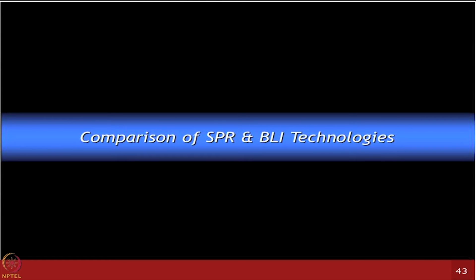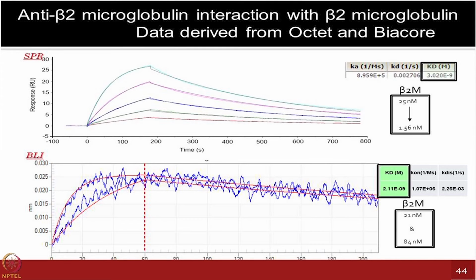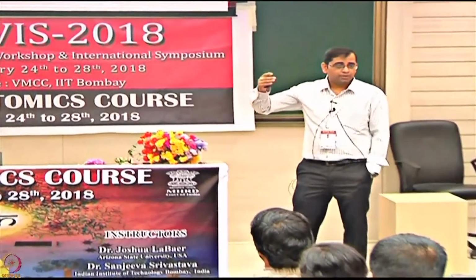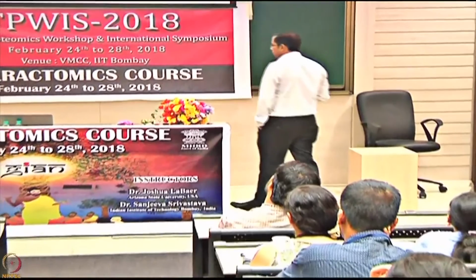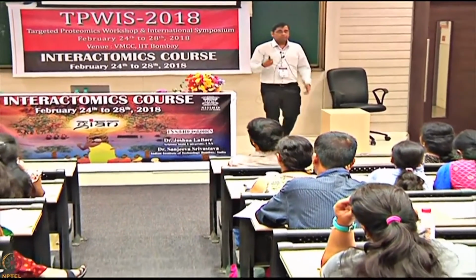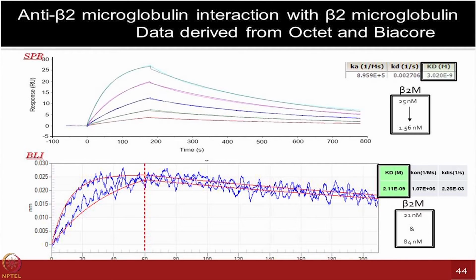All right, so I'm now showing you actual data from two different types of technology platforms. We compared, for a couple of proteins, both the Biolayer platform and the Biacore T200 platform for a few experiments, because cost wise they are very different, and acceptability wise things are different too, and in terms of GLP compliance only one platform is more compatible. So can we use at least the Biolayer platform as the first level of screening with high confidence?